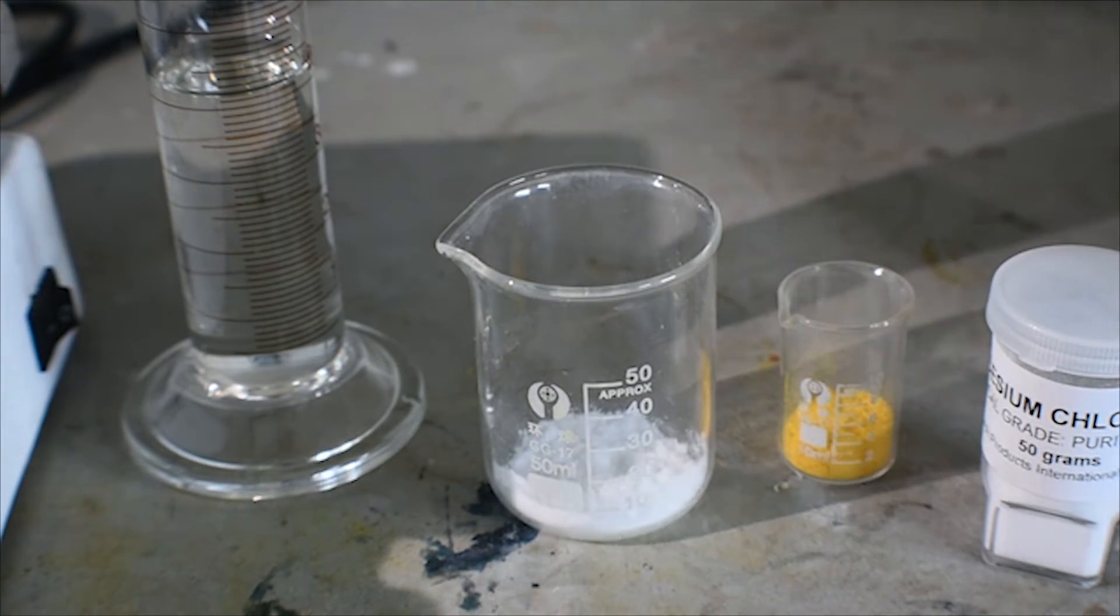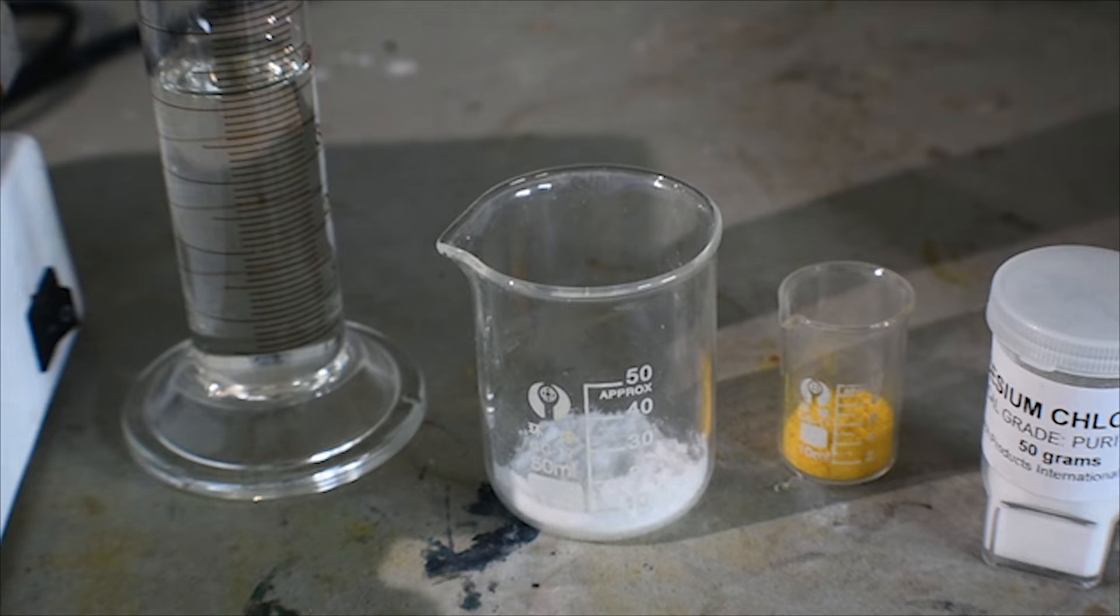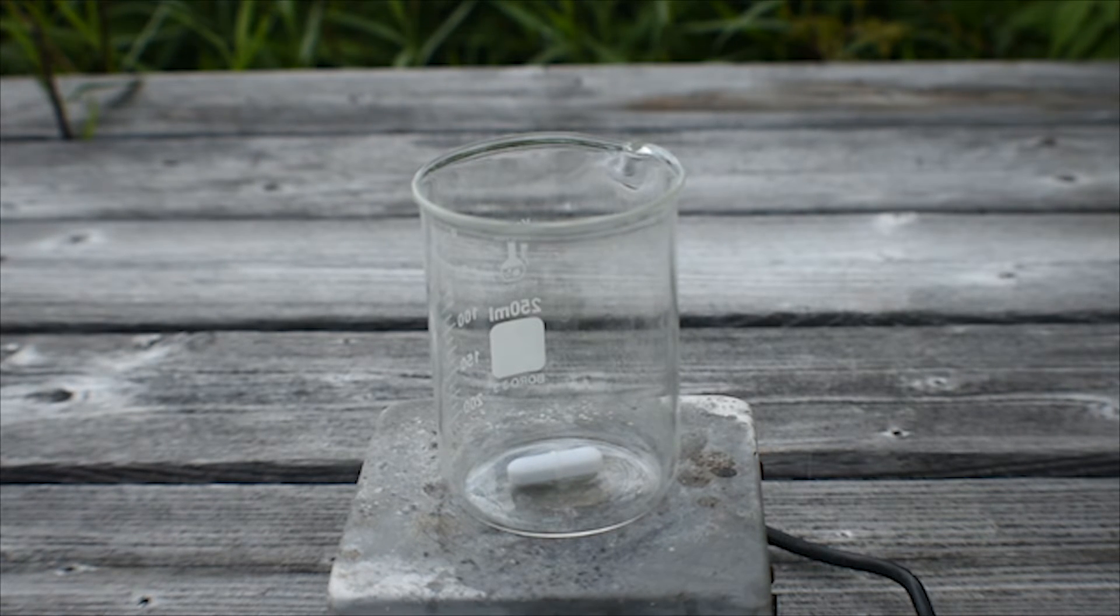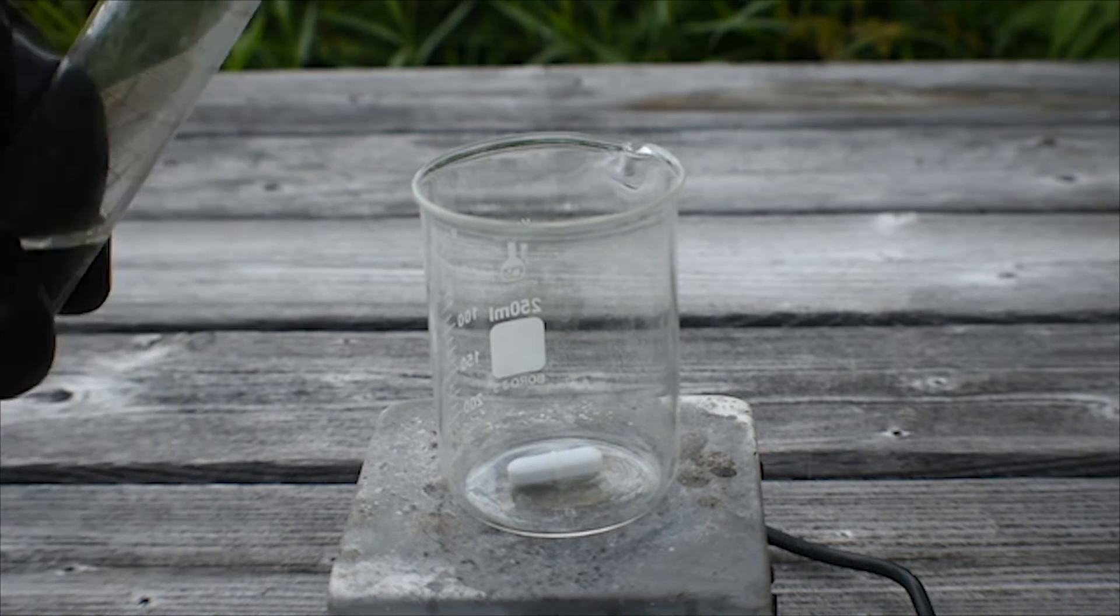So with that being said, I'm going to go outside where ventilation is much better and get on with the reaction. So now that I'm outside, I can continue with the reaction. So I've got a 250 milliliter beaker here, to which I'm going to add the 40 milliliters of hydrochloric acid.